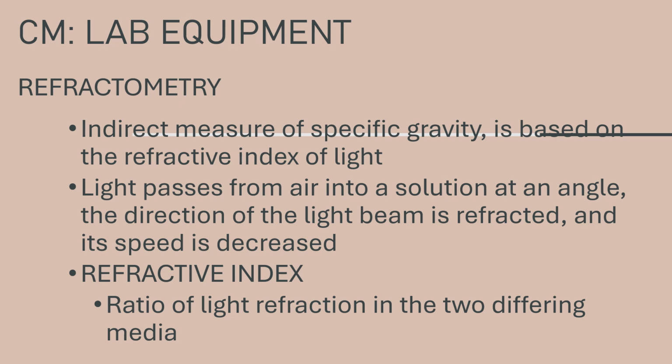Moving on to refractometry. The refractometer is laboratory equipment that measures the refractive index of urine to determine its specific gravity.